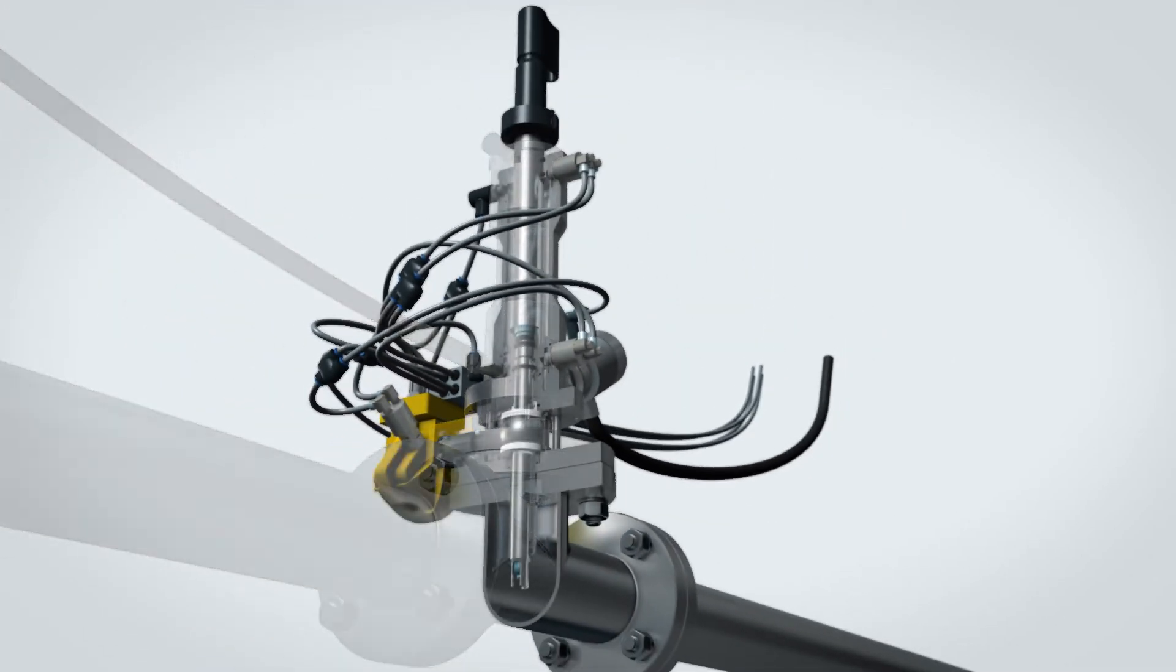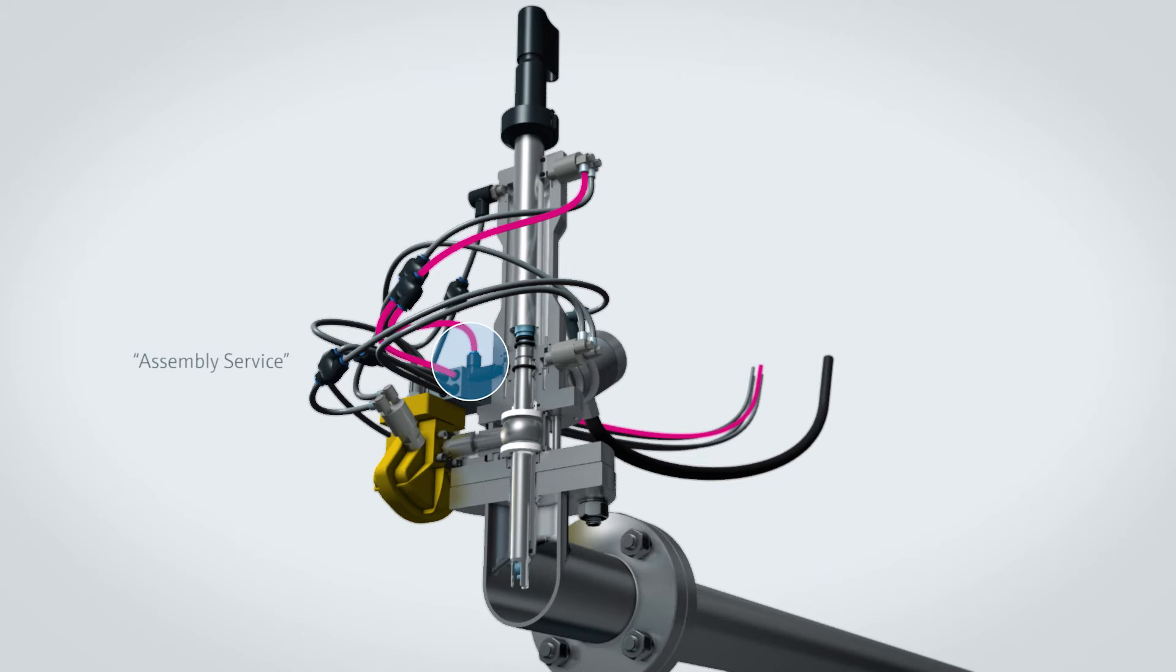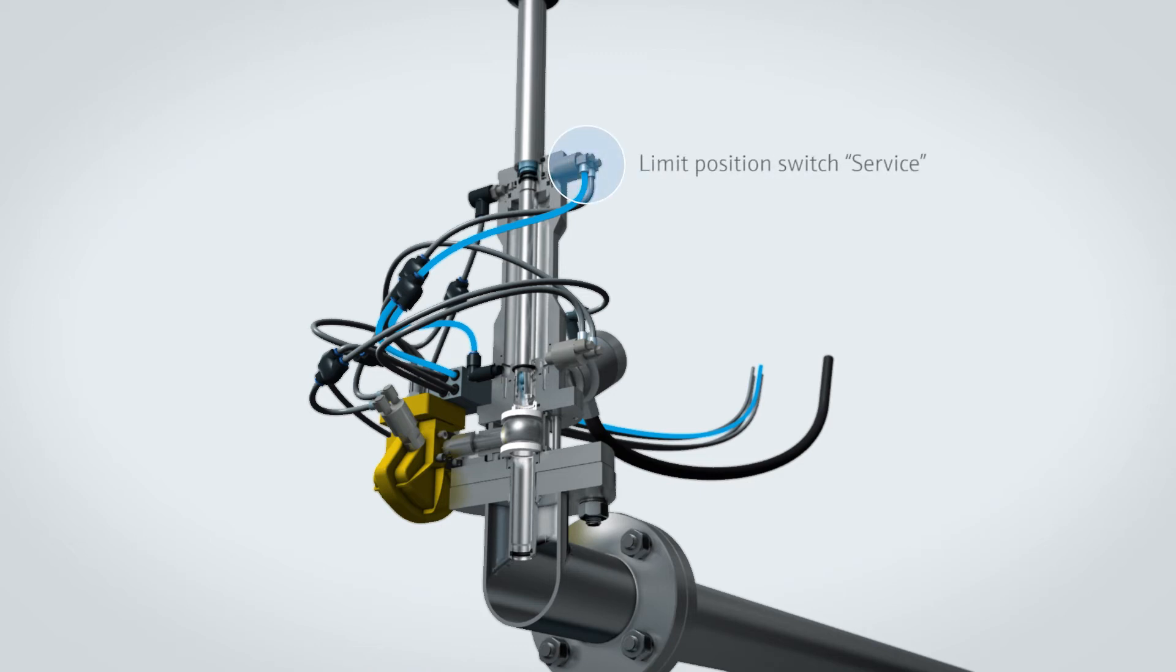In order to move the sensor, compressed air is simultaneously applied to the assembly service inlet and the service pneumatic limit position switch. The sensor holder with the sensor moves out of the medium and into the assembly. When the sensor holder reaches the limit position, the pneumatic limit position switch opens.